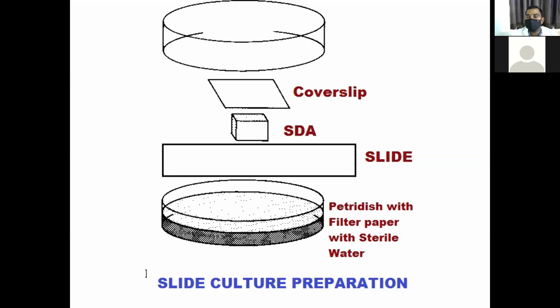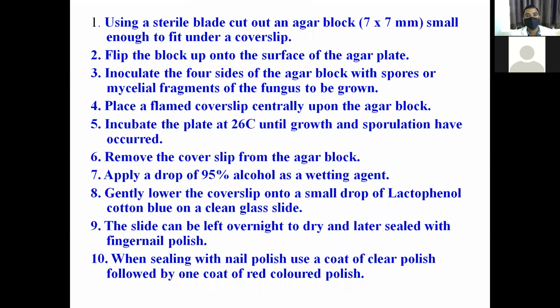You will see this very clearly: microscopical examination, macroscopical examination, and how to prepare the slide culture. You will follow it when you come back to college after this COVID vacation.